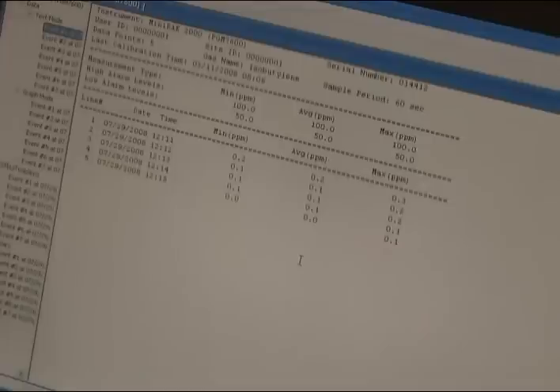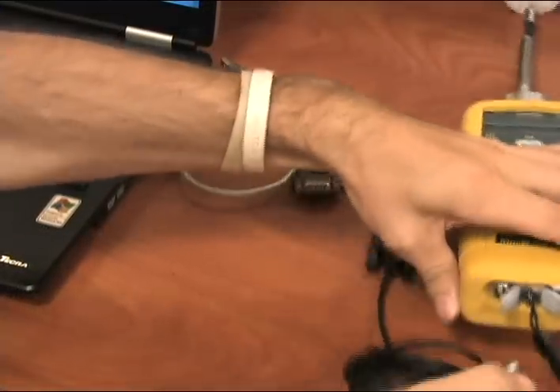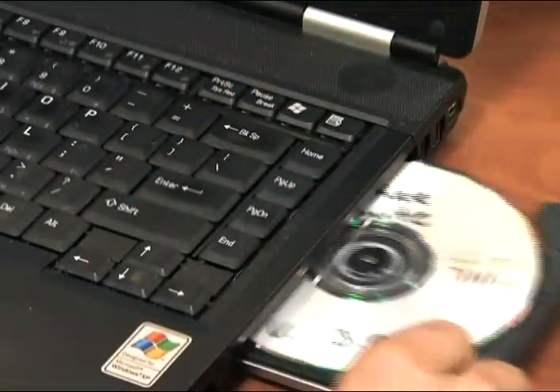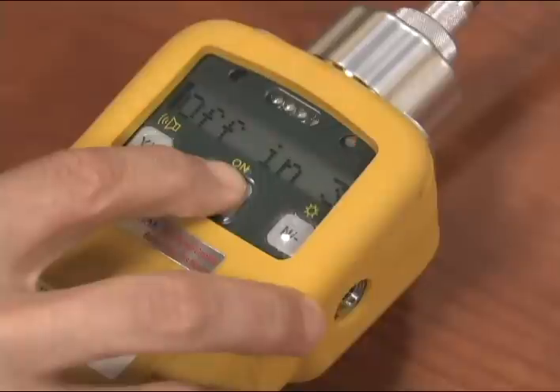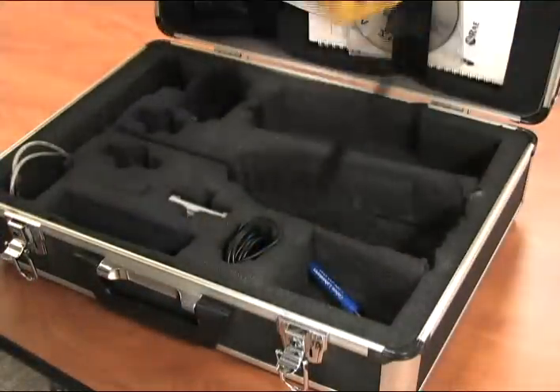When you have completed all report functions, disconnect the unit and shut down or remove the CD. Push the mode button once on the unit to go back to survey mode. Hold the mode button for 5 seconds until the unit turns off. Repack and ship back to Galson Laboratories.